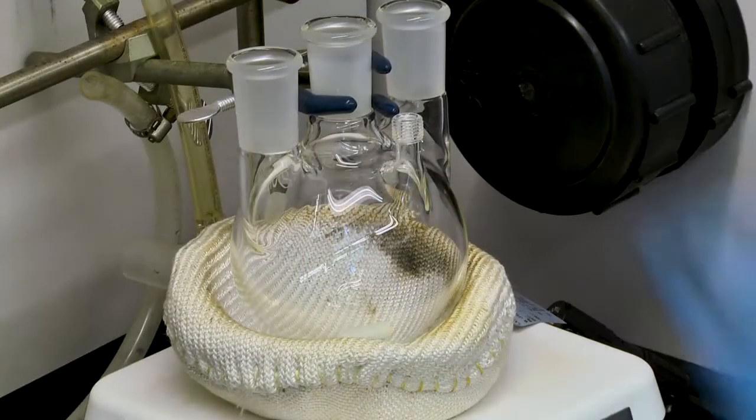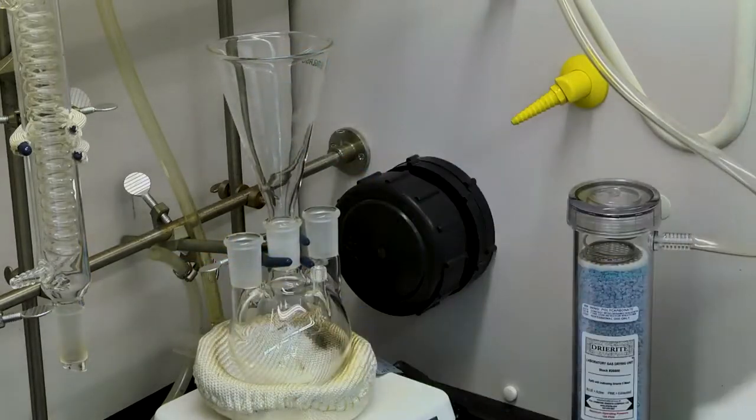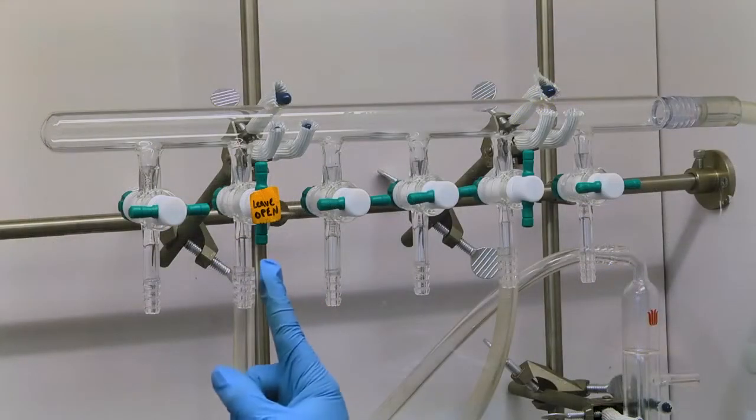Add a magnetic stir bar to the round-bottom flask and place a glass funnel in the middle neck of the flask. Make sure the safety and input stopcocks are open.